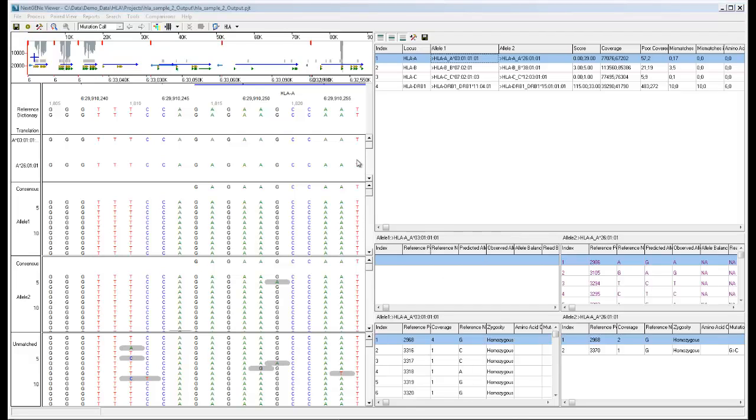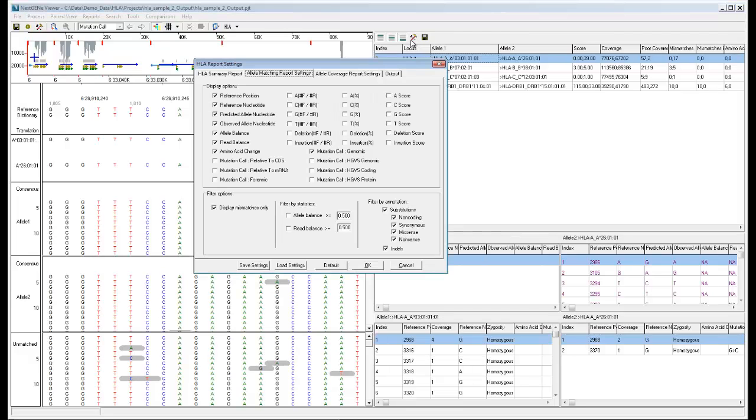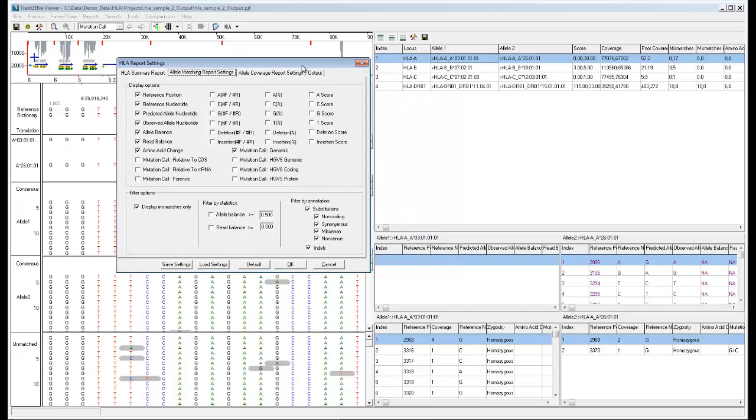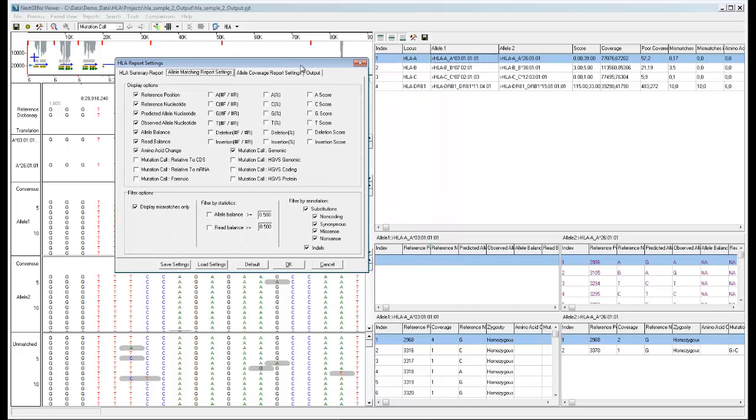You can click the settings icon to view the settings for the HLA report. The settings dialog includes a tab for each part of the HLA report.